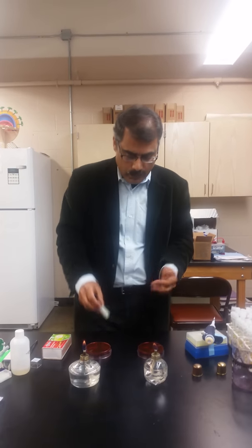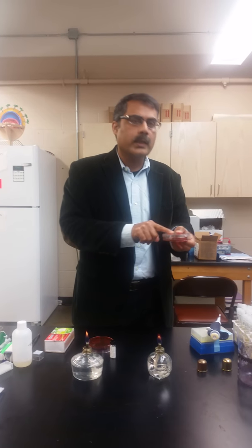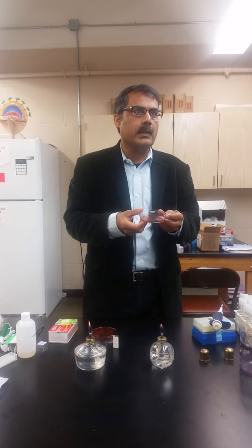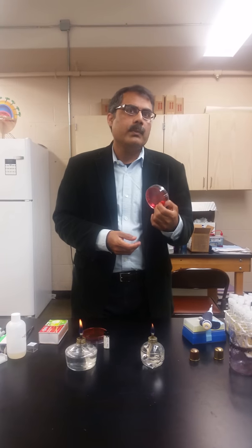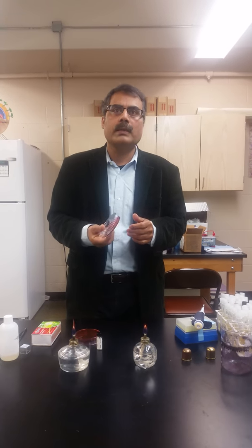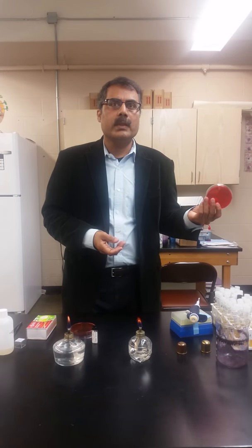One of the ways to do it is you can put your drug here and basically spread it and let it absorb into the medium. So if your bacteria, when you put it on here, grow on it, it means they are resistant to it. And if they do not grow on it, it means that they are sensitive. So just a quick screening will be done like this.